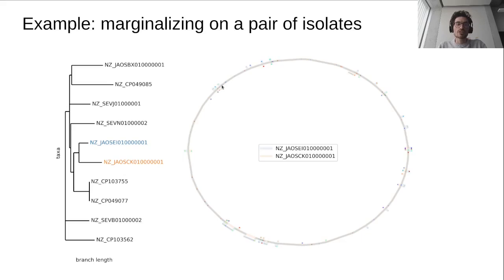And colored segments represent duplicated blocks. So these are segments such as the insertion sequence we talked about before, and we have reasons to believe that around these segments more structural diversity should be present. So in fact, they often correspond to deviations of the common backbone.